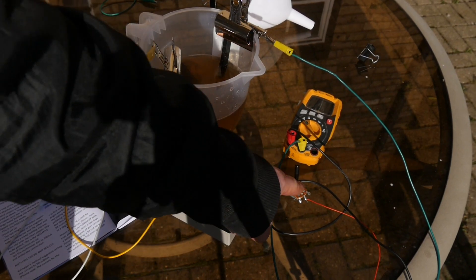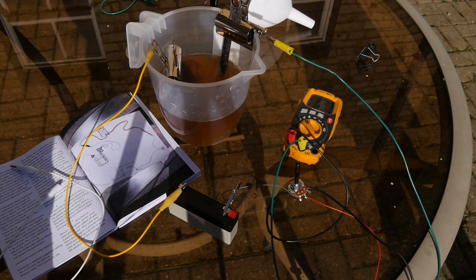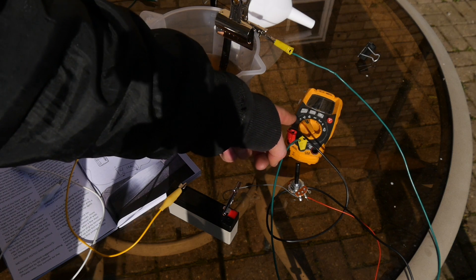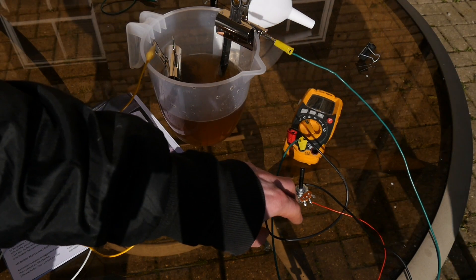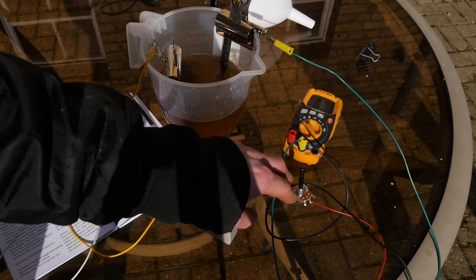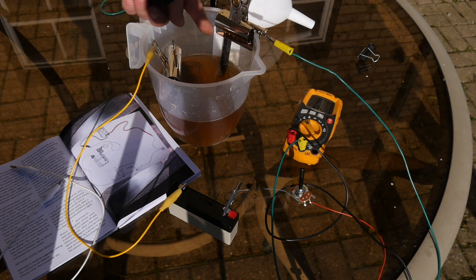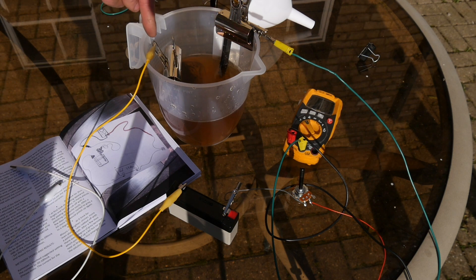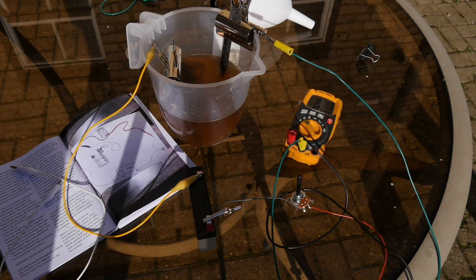The positive terminal of the battery is going through the potentiometer — I've just got a 47k potentiometer. It's going into the multimeter which is giving us the reading, and it's bouncing around quite a bit. That's coming out into the graphite pen, and then the cathode — the copper plate — is going into the negative terminal of the battery.